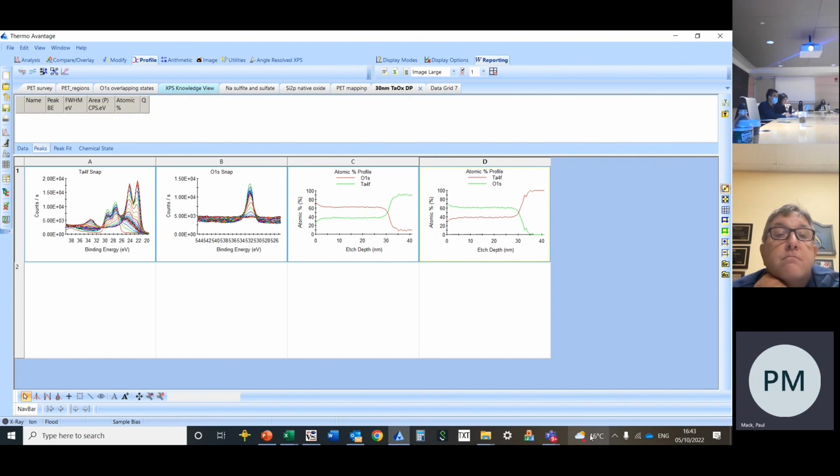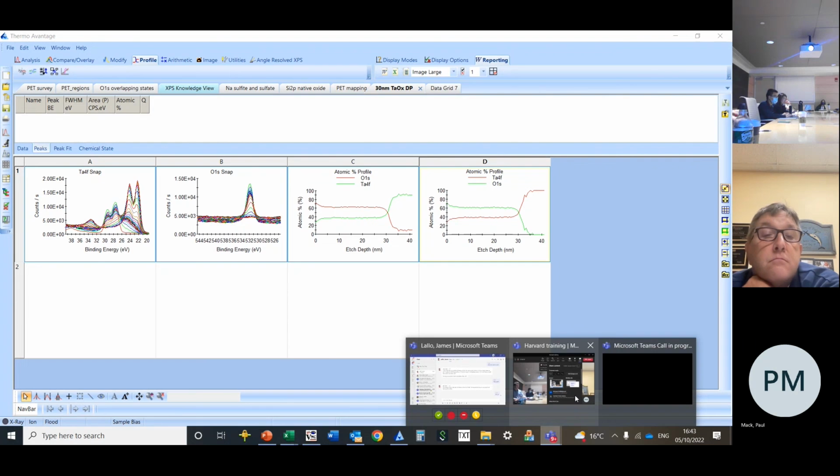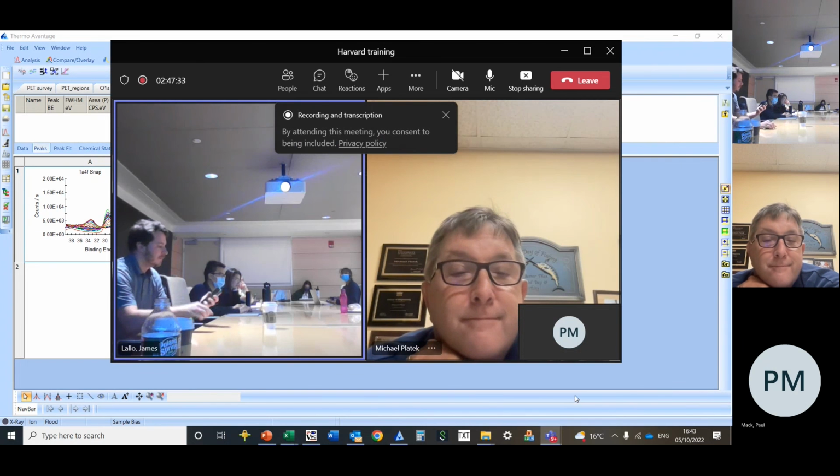So hopefully, if James is still recording, you'll be able to go back and watch that again. I am recording. I hope it actually gives me a video file. I haven't seen the first one yet. Okay.